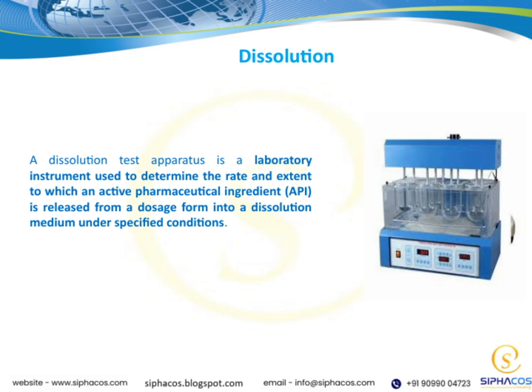The key point here is that the apparatus allows us to simulate the environment in which the drug dissolves, so we can assess its release profile. This information is vital for ensuring the drug's effectiveness and safety. Throughout this presentation, we'll see how this test fits into the larger picture of pharmaceutical development and quality control. Understanding the dissolution process helps us verify that our formulations will perform reliably inside the body.